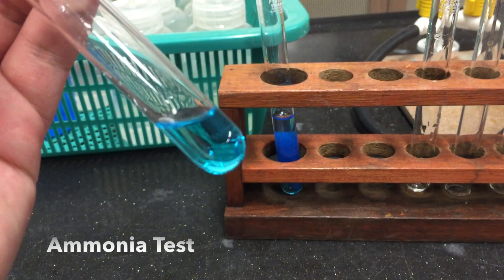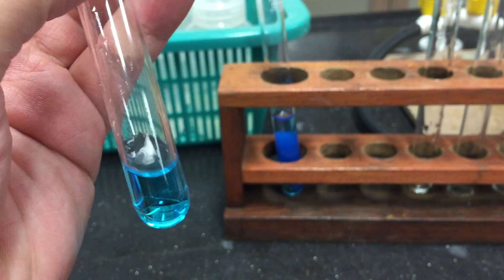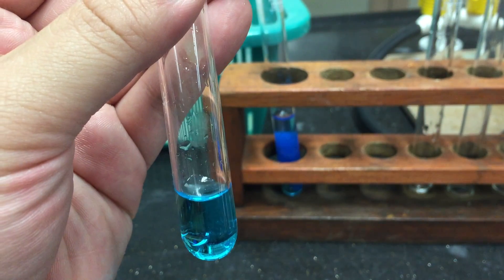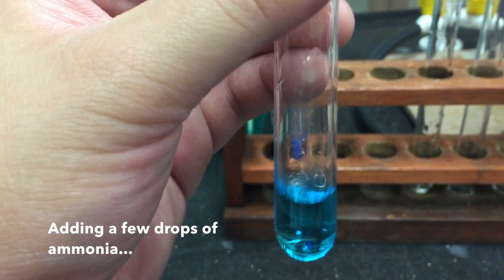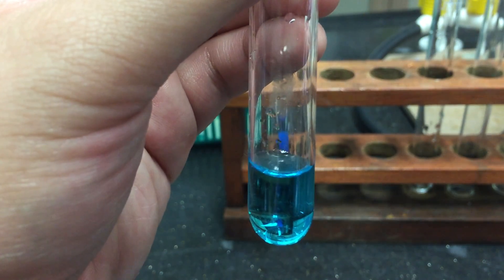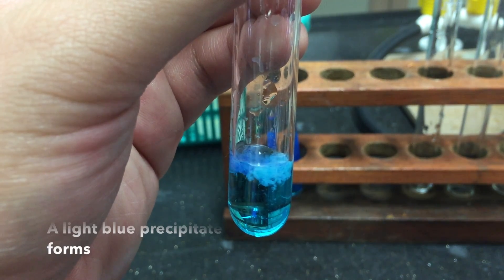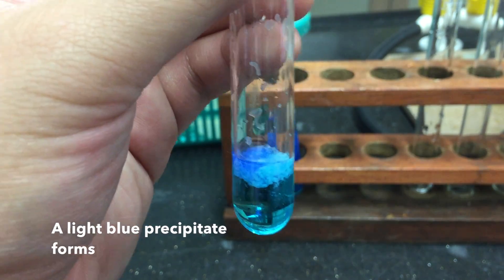Another test you can use is the ammonia test. To a small sample of your solution, add a few drops of ammonia solution. You will notice a light blue precipitate forms immediately.